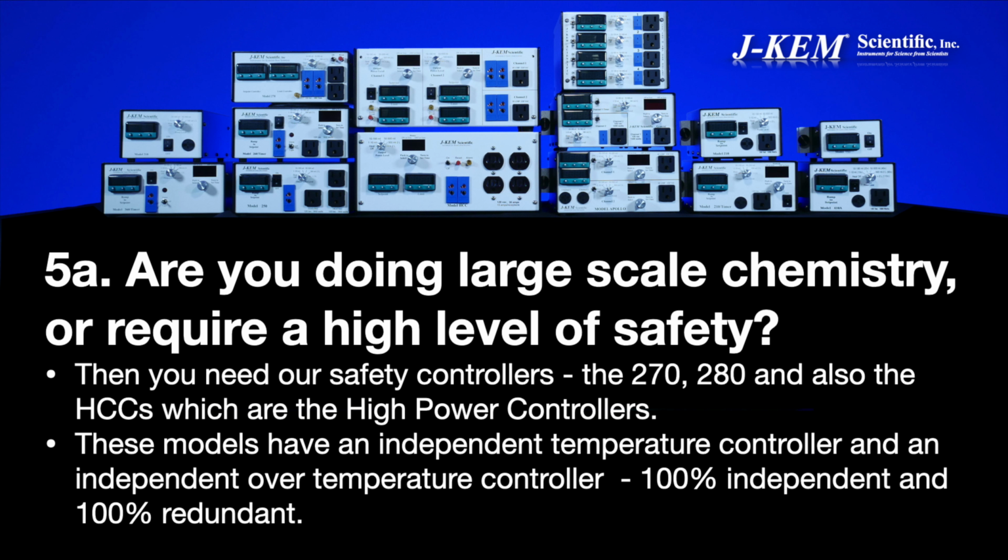Another consideration is for people who do process scale chemistry, large scale chemistry. When you move to large scale chemistry, you need 2 things. You need controllers that have more power and maybe even a little more sophisticated in their heating. And you need controllers that have inherently built-in safety features that aren't necessarily needed when you're doing a 100 milliliter reaction. And so we have a series of high safety controllers.